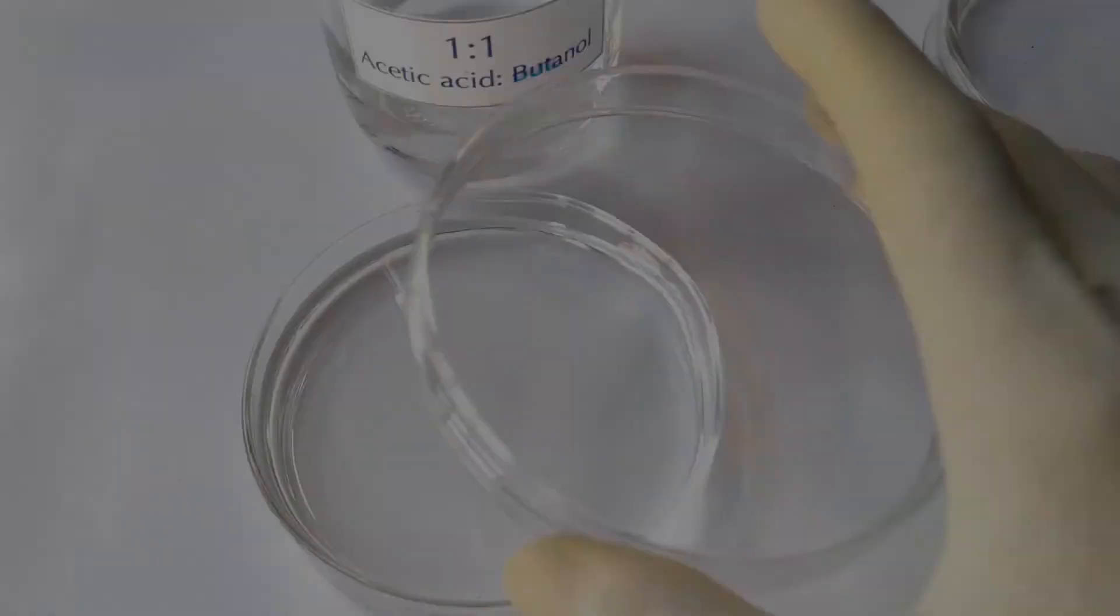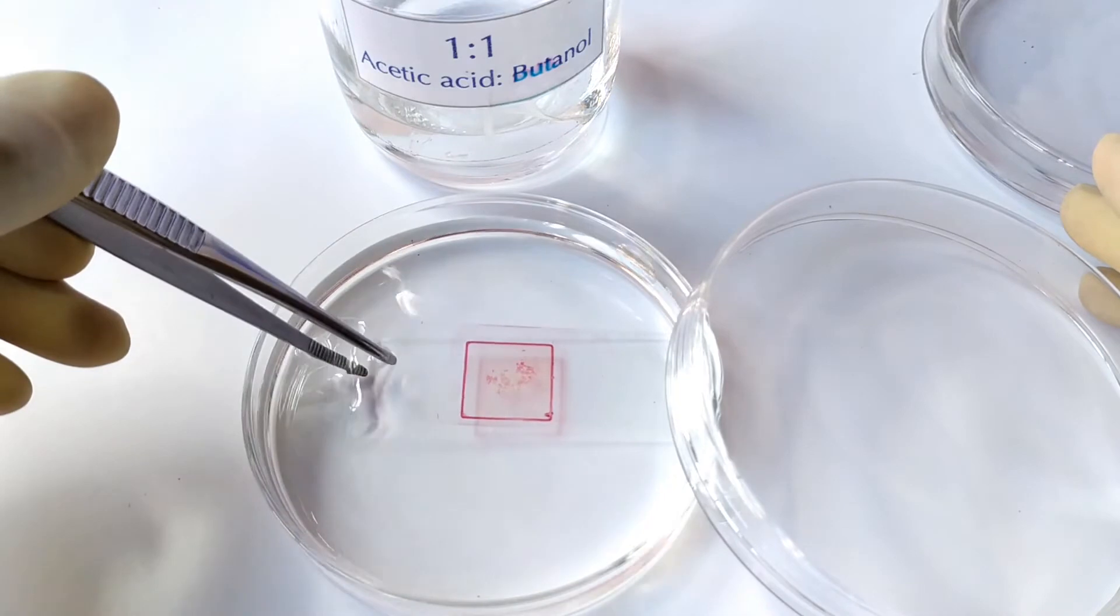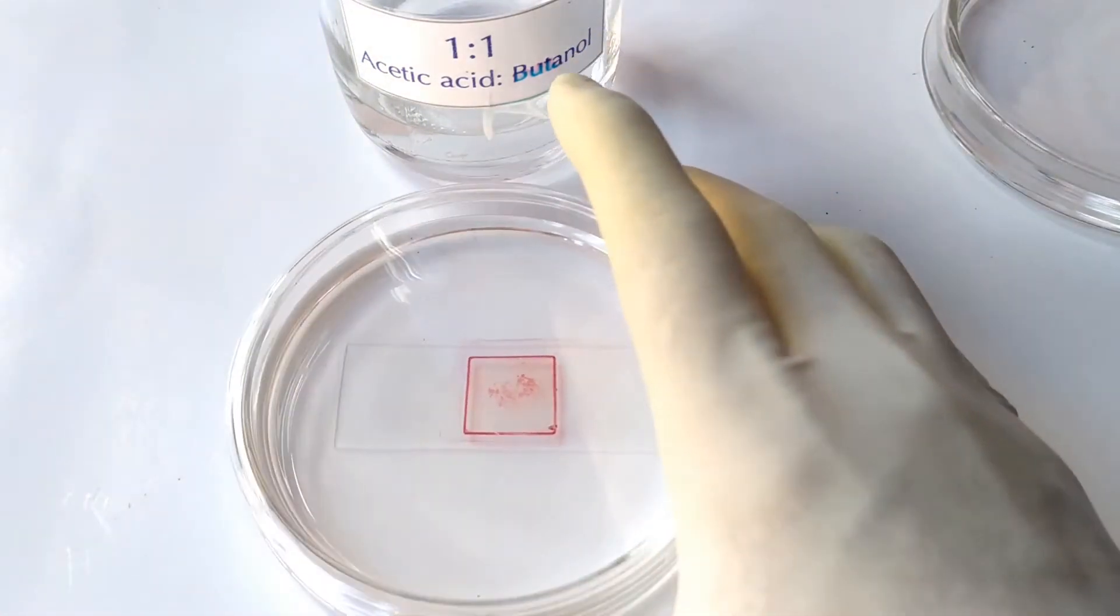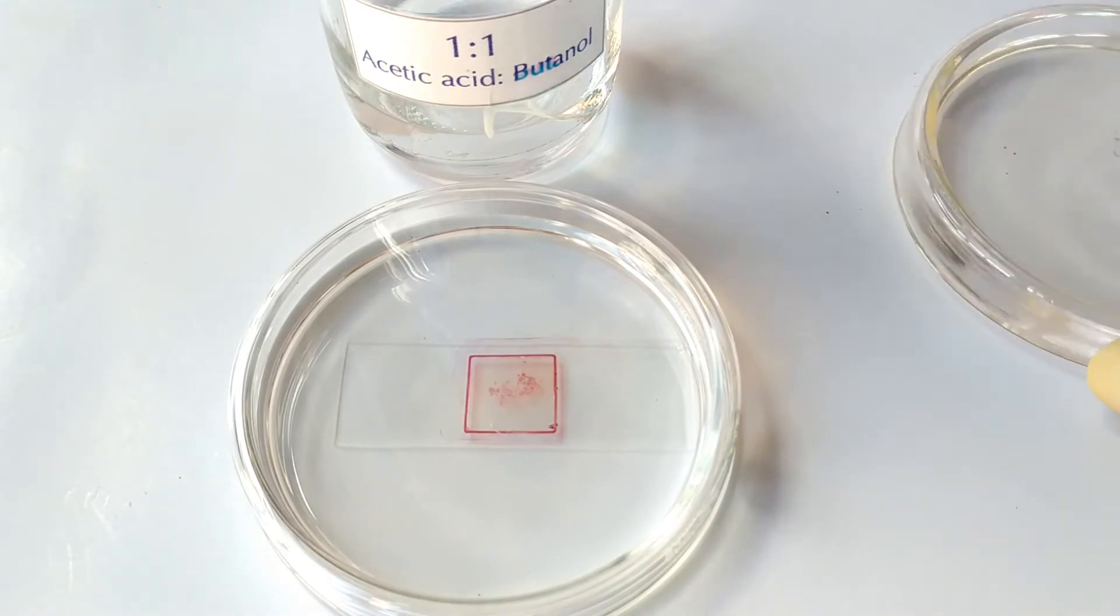To begin the process, take the temporary slide that we have prepared and immerse it into a coplin jar or a petri dish containing equal parts of butanol and acetic acid. Cover the jar or dish and leave the slide for about 10 minutes.